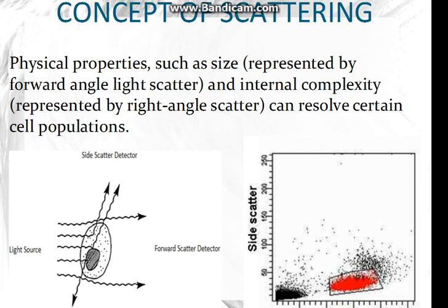Then what is the concept of scattering? We understood that when the single cell preparation is falling down, there is laser light falling on it, there will be scattering. What is it? Now what is scattering is that this is a cell. Okay, this is its nucleus. Okay, so this is the light falling. It falls on the 180 degrees and then it scatters. Okay, this is the scatter.